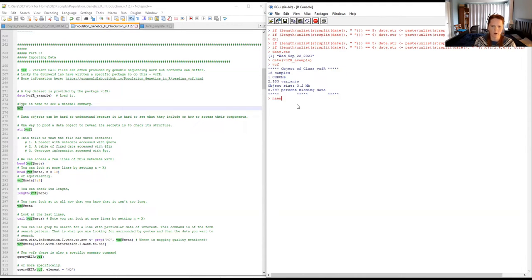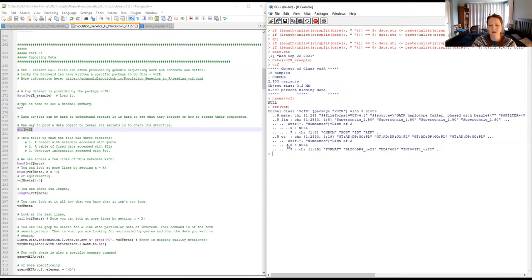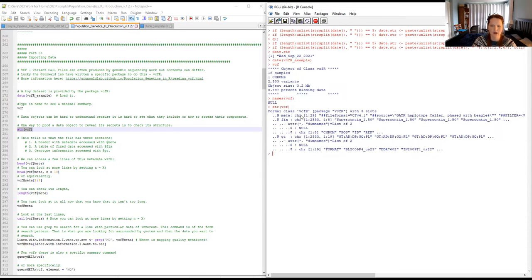But now what? How do I interact with this object? We can use the structure() command, which prints out exactly how the data object is structured. What you want to look for is either a dollar sign or an at symbol — those tell you the partitions within the object. We see three sections: a metadata column, a fixed table of data, and a genotype or GT table. In vcfR, the documentation tells you what each of these means. You can access those particular partitions using the at symbol or dollar sign.